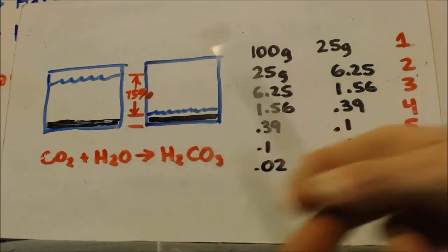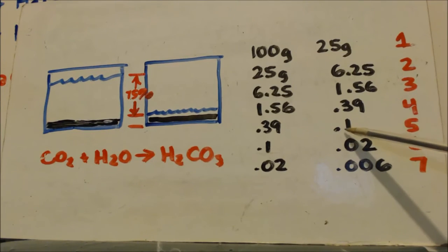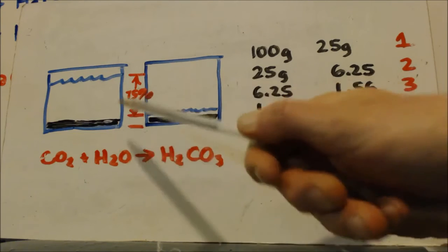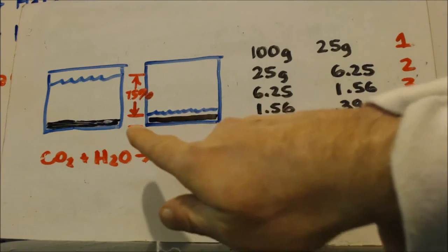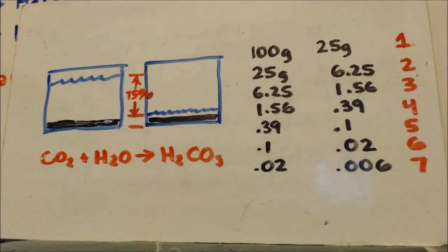And that's out of the whole. If you're only making a little bit, then you'd have smaller numbers. But if you're making a lot, to have 0.1 or 0.3 or even 1 gram, it'll be an impurity, but 0.3 grams out of this, this might be 500 grams of stuff.